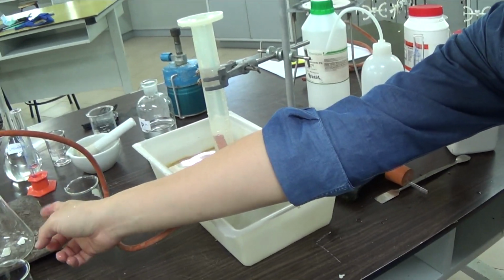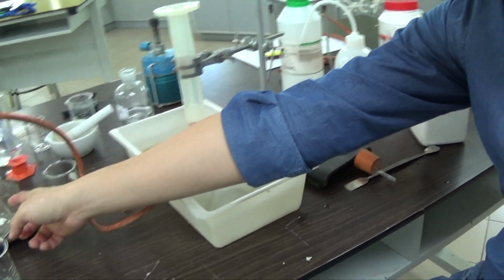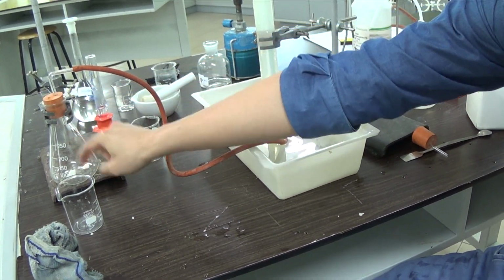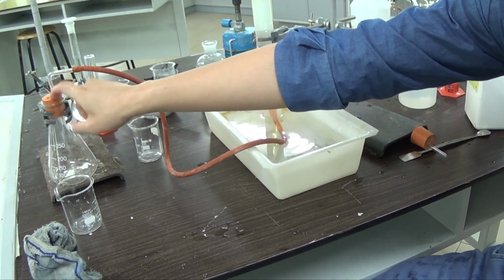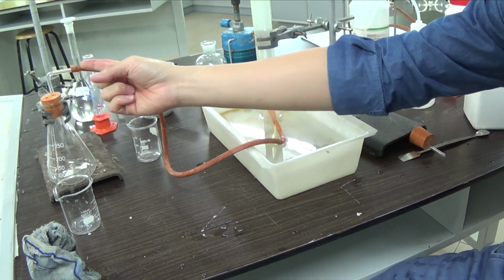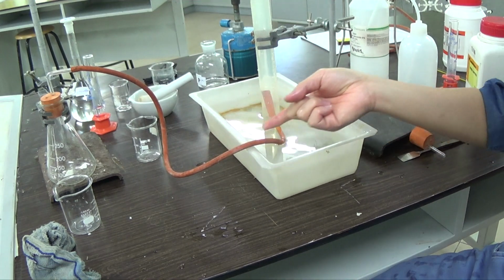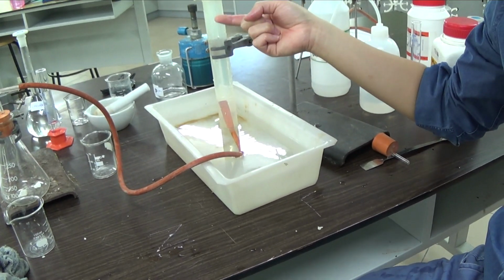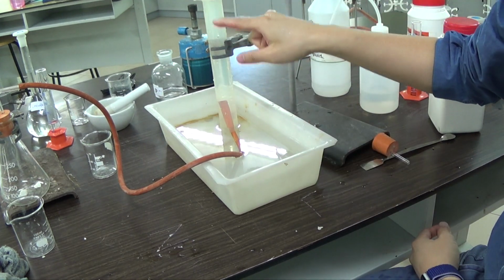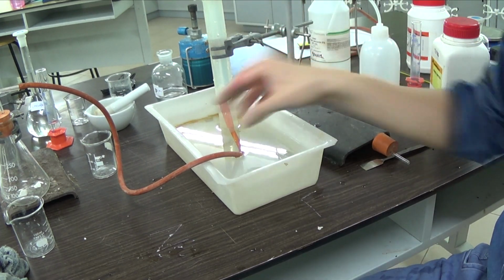So this is the conical flask, and this is the reaction here. The conical flask, this reaction, is sealed with an airtight rubber bung. The gas produced passes through the delivery tube, and then gets collected in this measuring cylinder. This is an inverted measuring cylinder. It's got water filled up to the very top. So I'm ready to start my experiment.